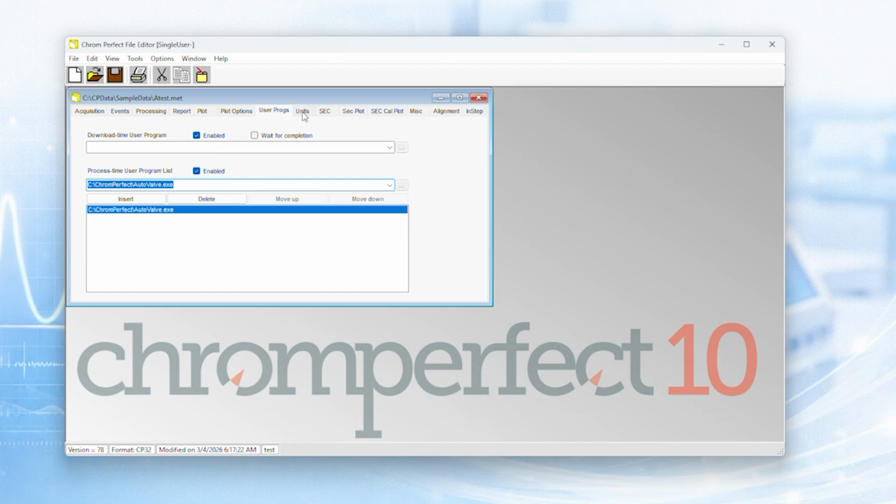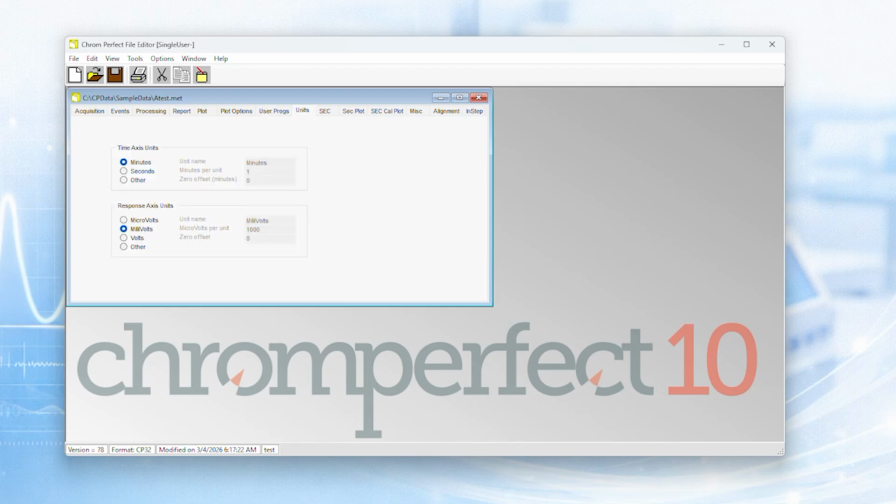Next is the Units tab. The Units tab defines measurement units used in reporting and display. It determines how values are expressed, not how they are calculated at the raw signal level.